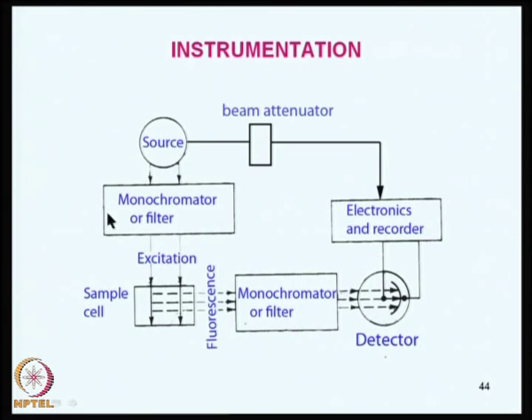So, if you take a look at both the emission and excitation spectrum, you will be surprised that quite often they are mirror images of each other. It is a fantastic concept, but it is a fact. Now, let us look at the instrumentation of the spectrofluorimeters.